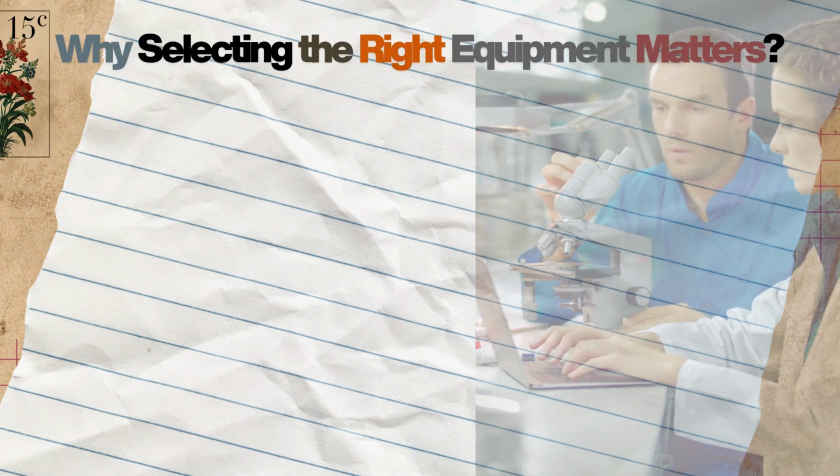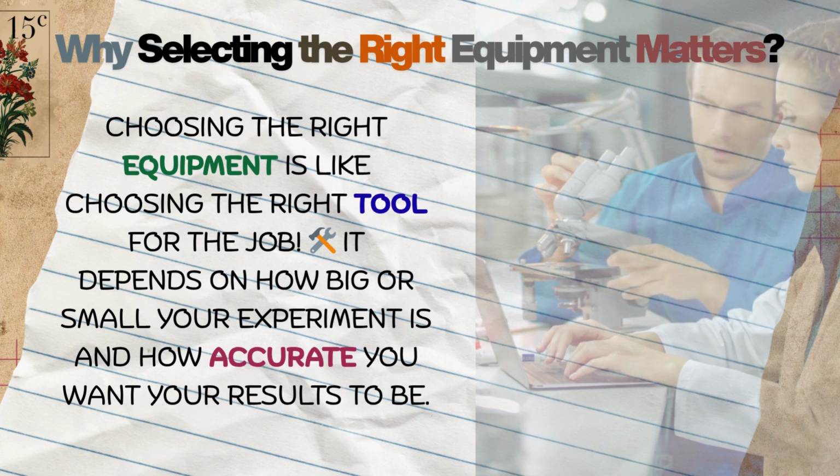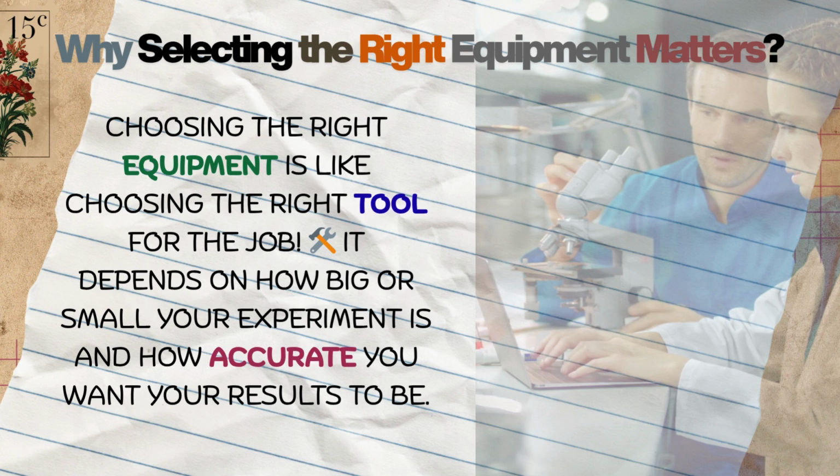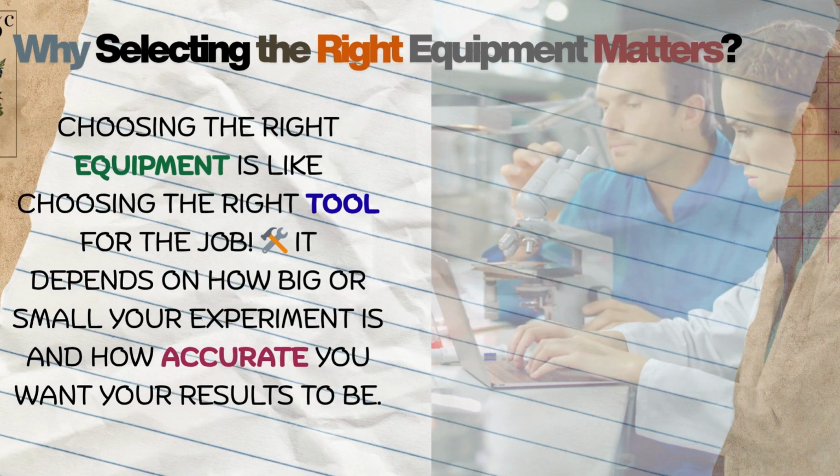First of all, why does selecting the right equipment matter? Choosing the right equipment is like choosing the right tool for the job. It depends on how big or small your experiment is and how accurate you want your results to be.